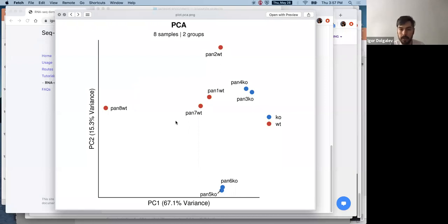If you're just looking at different treatments, the natural biological variation is going to be much higher than your stress. But here, we do have a nice separation, although one might say that this PEN8 sample, on PC1, which explains most of the variance, seems substantially different from any of the other samples. So maybe there's some problem with it, or maybe it's natural. It's hard to say. But if you have additional information that might tell you that the sample should look weird, then this just confirms it. Again, it's not terribly different, and it still groups together with the rest of the wild types.